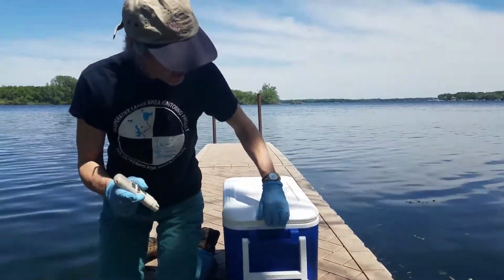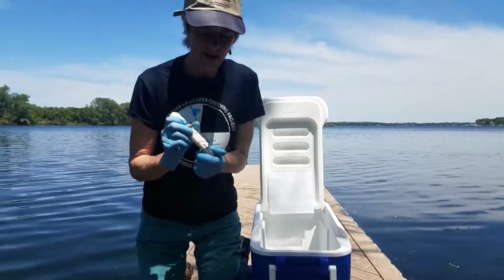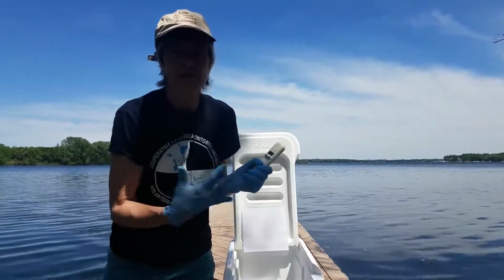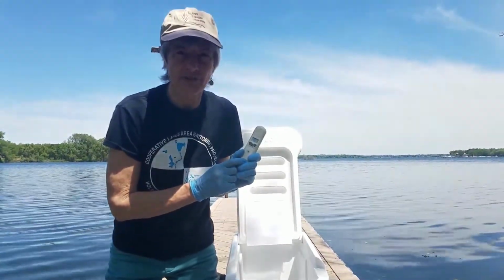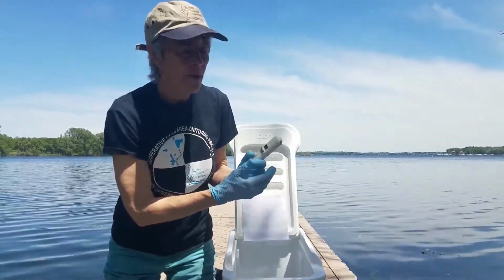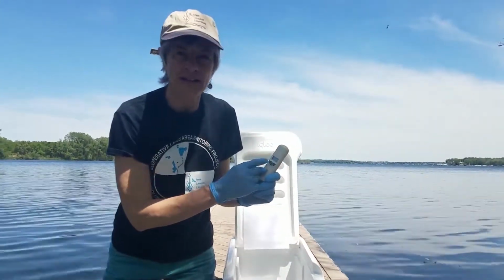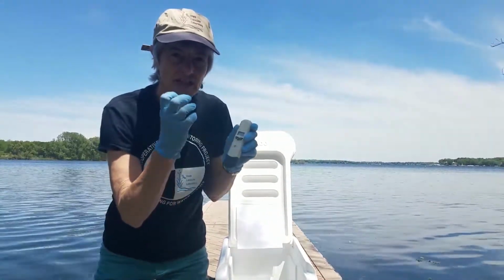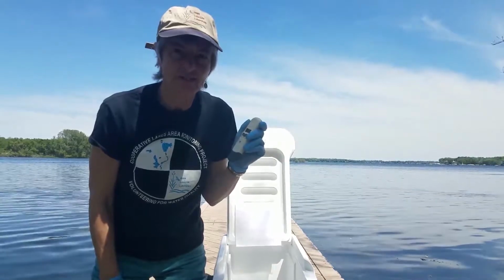So that's all there is to it. As soon as you're done, you find that cap that you've kept in a very safe place, put it back on, and then you can either power it off or you can leave it on till your next location where you stop. These do shut off automatically after about 20 minutes, so either way, I guess I'm going to power this one off. But if you don't power it off and you go to your next location, you'll have to remember to hit that hold button again to release the reading for the next reading. When you're reading your pH, you should see that decimal flashing. If it's not flashing, that means you probably forgot to release the hold button from the last reading.